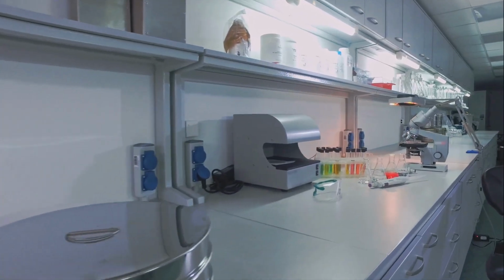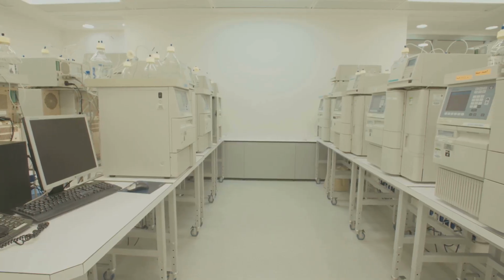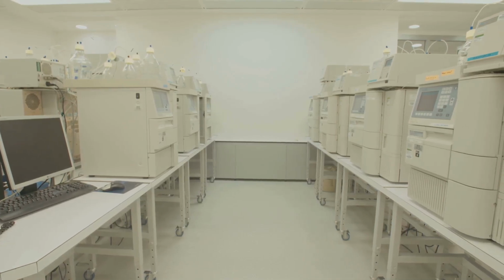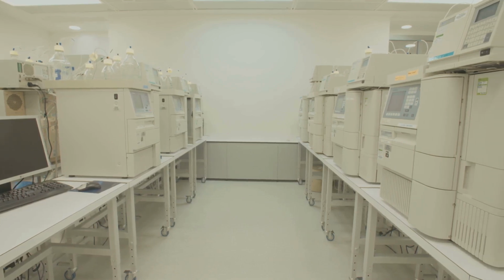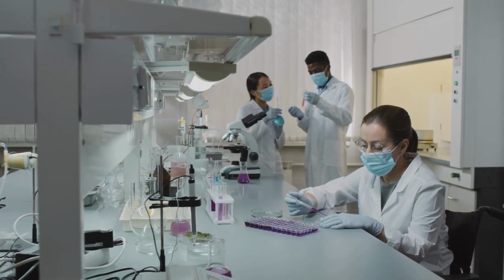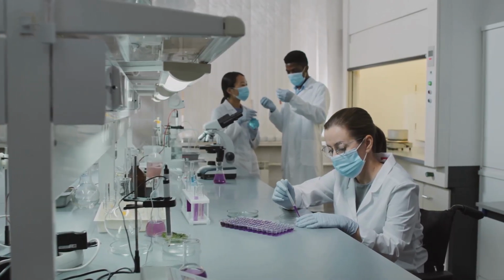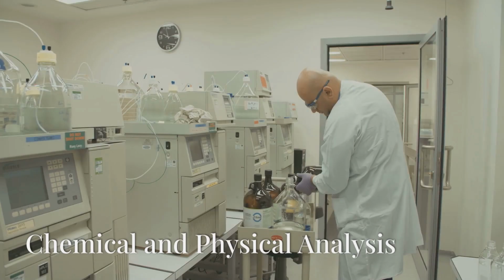Welcome to our in-depth module on quality control. In this video, we'll explore critical aspects of quality control in the pharmaceutical industry, including chemical and physical analysis, instrumental techniques, and good laboratory practices. We'll also discuss standards, microbiological applications, impurity analysis, calibration, packing material analysis, and post-release monitoring. Let's dive in.